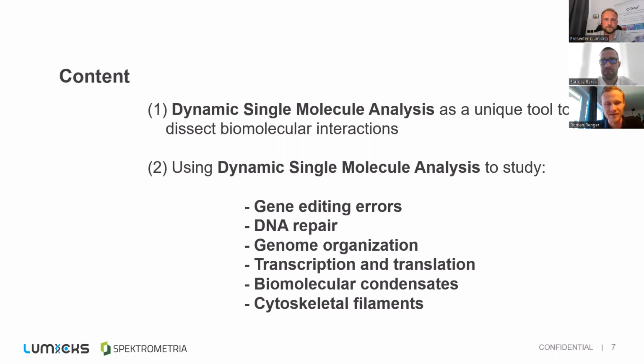And I, in my role as an application scientist, will now dive a little bit more into the scientific or technical details of this technology as such that we call dynamic single molecule analysis, which we think is a very useful and unique tool to dissect biomolecular interactions.